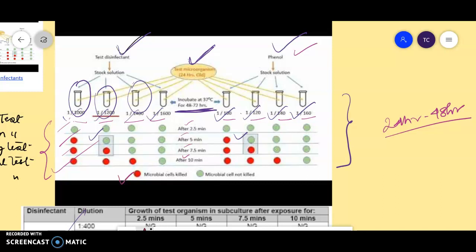Red color indicates microbial cells are killed and green color indicates microbial cells still persist. You can see that at a dilution of 1:1200, the organism is growing at 5 minutes but not at 7.5 minutes. That is the key condition: the dilution at which the organism is killed at 7.5 minutes but not at 5 minutes. This same condition applies for the phenol standard.